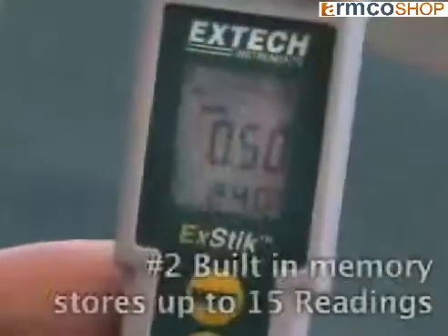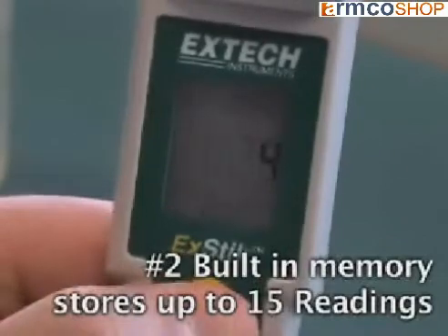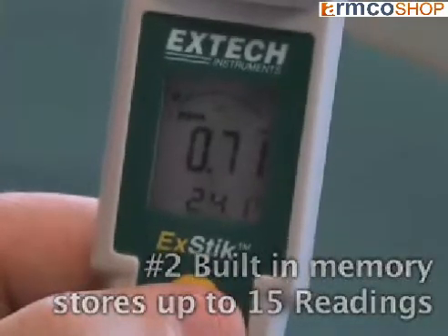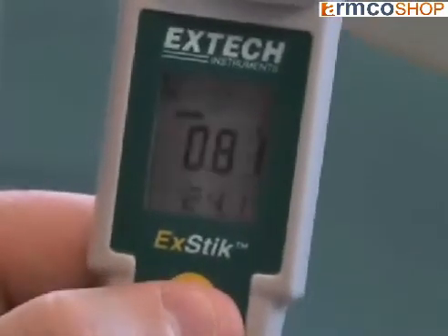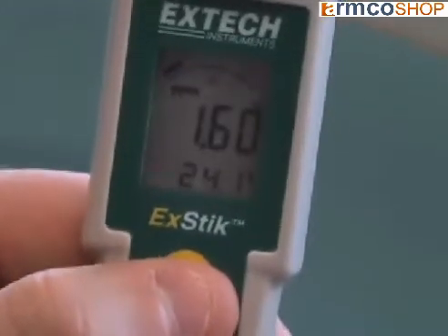Number 2. The internal memory allows for data recording of up to 15 readings and is labeled sequentially for easy recall. This feature eliminates the need to bring samples back to the lab. It not only saves time, but provides maximum accuracy for on-the-spot data recording.